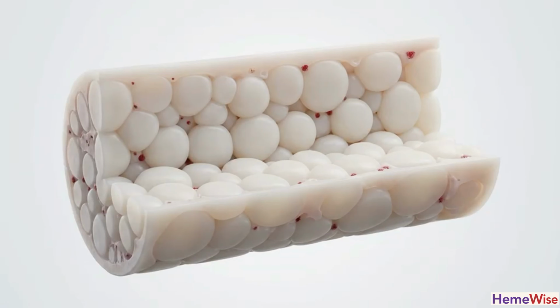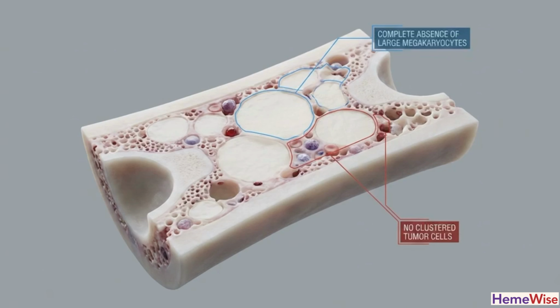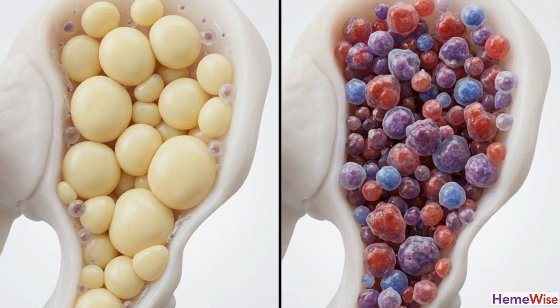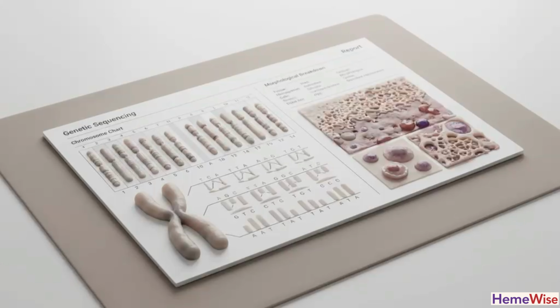Integrated diagnostics are required to resolve difficult differentials, such as the profoundly hypocellular marrow, where fat replaces hematopoietic cells. In severe aplastic anemia, the trephine shows a marked reduction in cellularity, often below 25%, along with an absence of megakaryocytes and a lack of malignant infiltrates. This must be distinguished from hypocellular MDS. Accurate diagnosis depends on finding evidence of dysplasia or clonal genetic abnormalities, rather than relying on the low cell count alone.